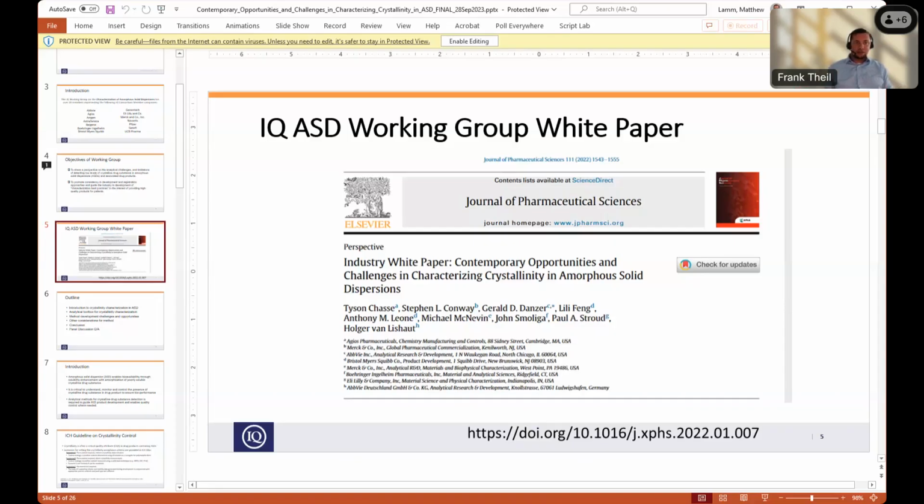And this resulting effect was translated in the chemometric model to a loading, which in principle corresponds to a spectral signal. And this will, in most cases, not be exactly the same as the crystalline content. So this is usually a challenge that you get afterwards when you have your model and are discussing it. Another practical challenge I can talk about is the transferability of model parameters from chemometric software to chemometric software.